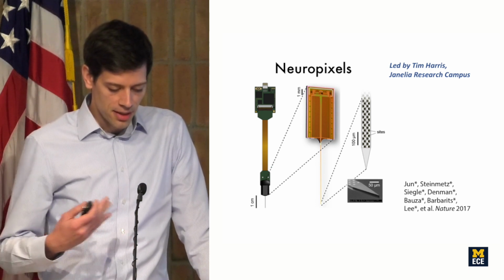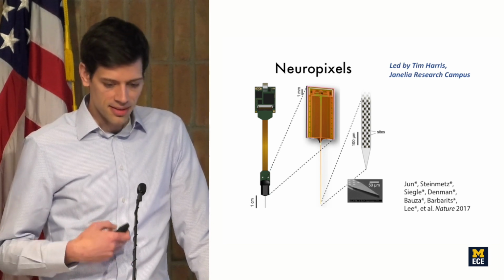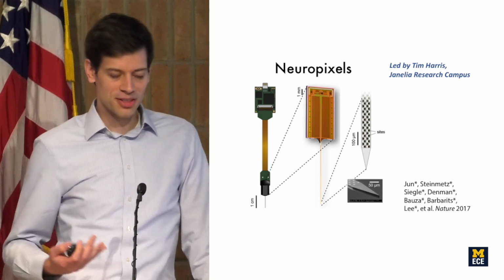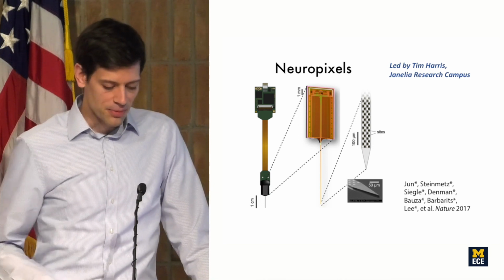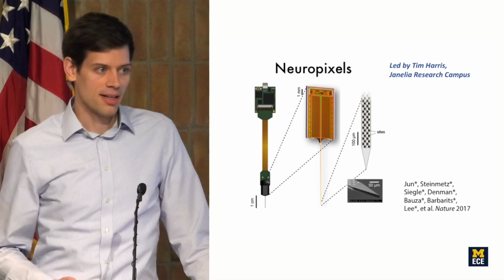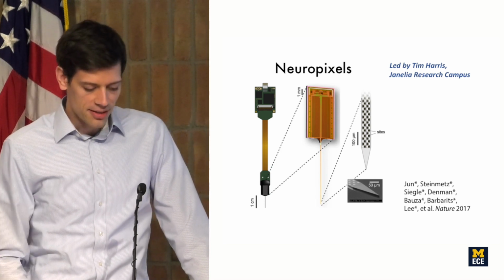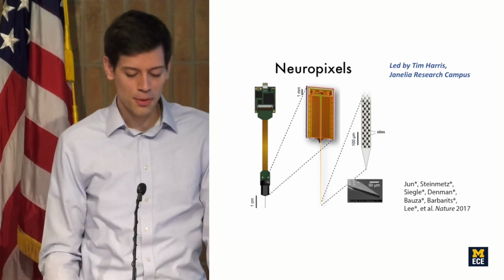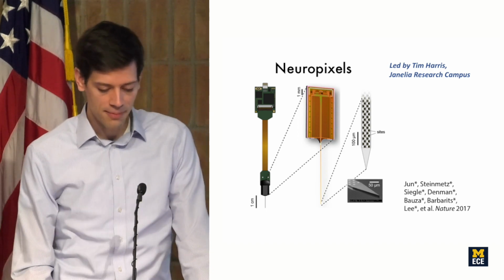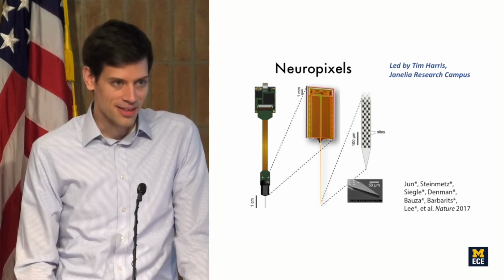So this is a device that I think is a new concept to many people in the field. It was to me. Actually, I was recently learning about the work that Ken Wise and Khalil Najafi did here in the 80s, pioneering this concept of putting active electronics on the probe. So that concept really came from University of Michigan, and it's fun to be here and talk about this work.